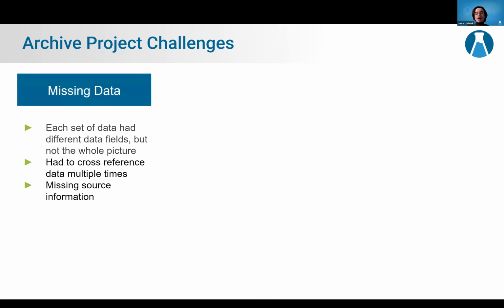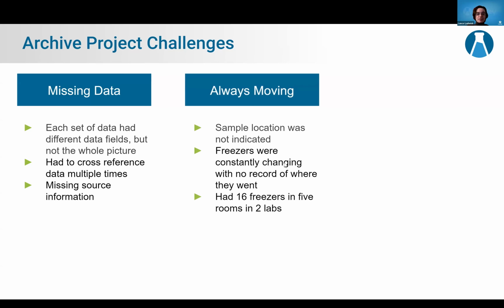And from that, I had to cross-reference all of these different spreadsheets, these different LIMS, written records, multiple times just to figure out what I was looking at. And it took a very long time to do. And not only that, but some of the data was outdated, particularly where these samples were stored. And because the vast majority of these samples were in a historic LIMS or in an Excel spreadsheet that only myself and IT had access to, the lab techs couldn't check these boxes in and out of freezers. So it was very challenging trying to figure out where these boxes were.